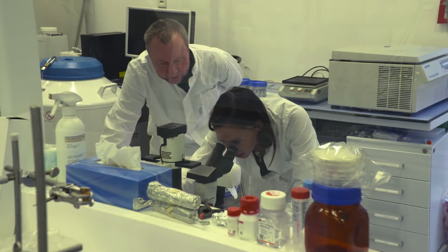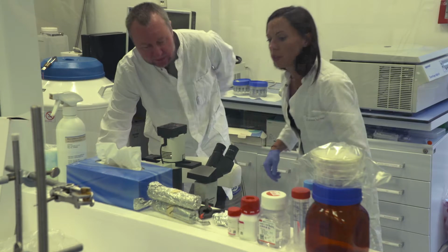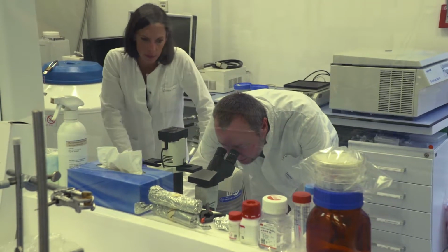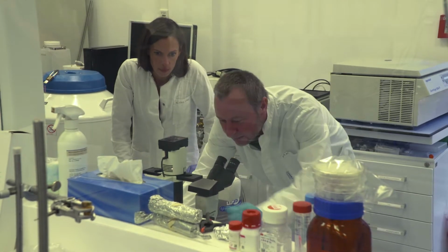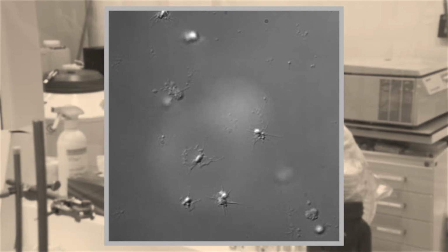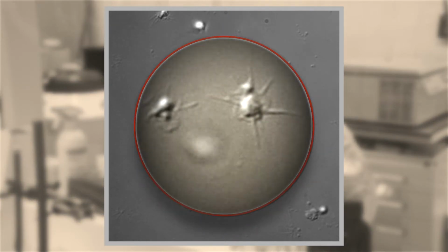Light microscopy allows the characterization of blood cells in real time. By looking at the cell morphology, protein movements, and cluster formation, researchers can determine the state of blood and thus the quality of transfusion blood supplies.